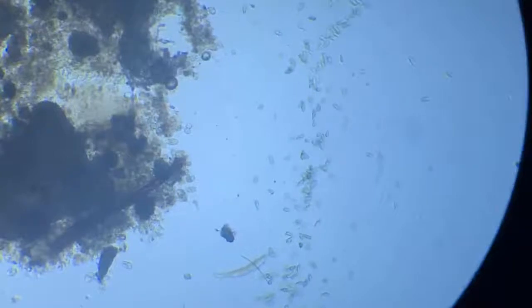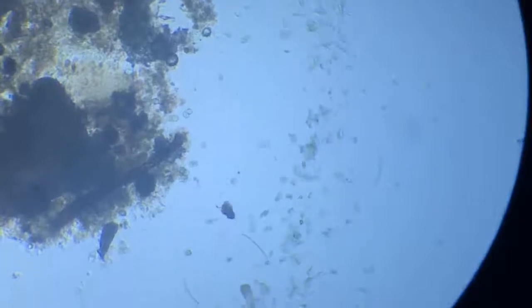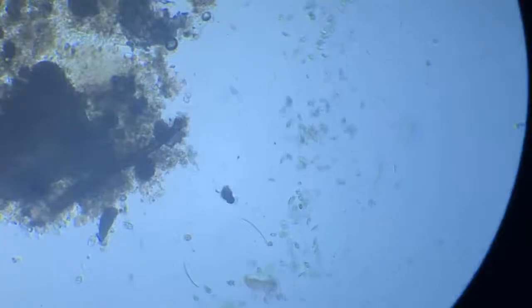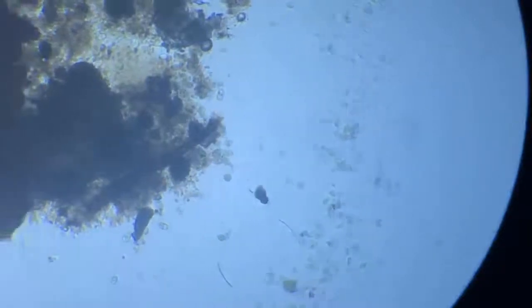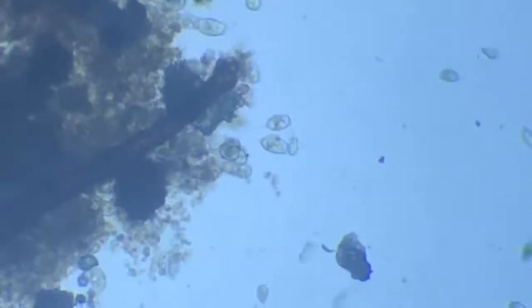Okay. So we have these few ciliates on the screen. And now we'll just focus on this part because we find some vorticella. Yes, beautiful. There are some vorticella here actively busy with feeding. There you see them. They are filter feeders, and we'll observe a few activities of these animalcules.